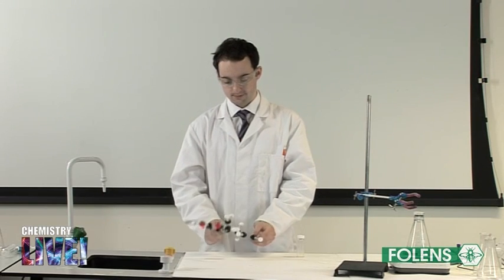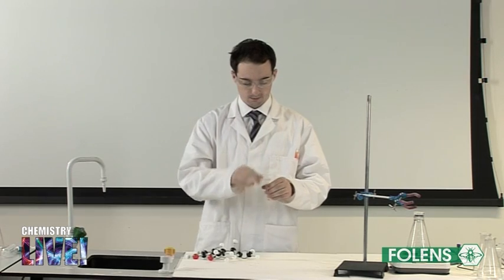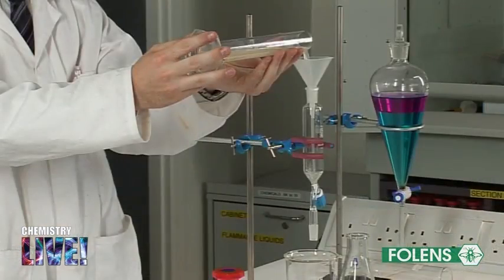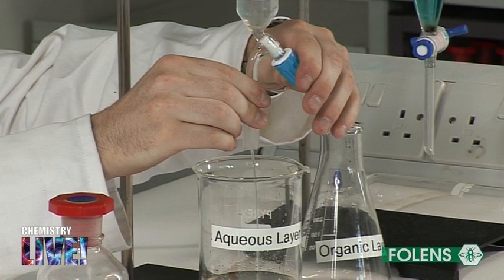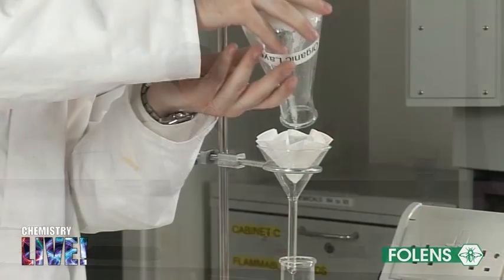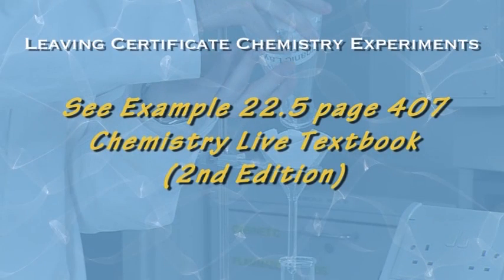Do not allow the oil to come in contact with your skin, as it has a burning effect on skin. Note the smell of the clove oil. Record the new mass of the conical flask and calculate the mass of oil formed. Using the results of this experiment, it is now possible to calculate the percentage of oil obtained from the cloves. A sample calculation is shown.